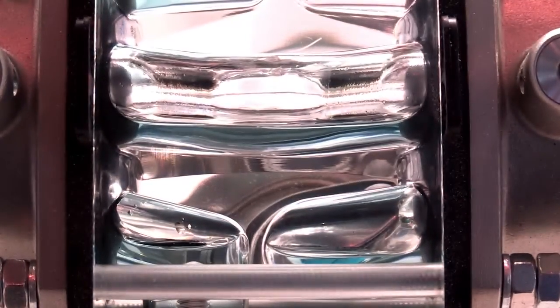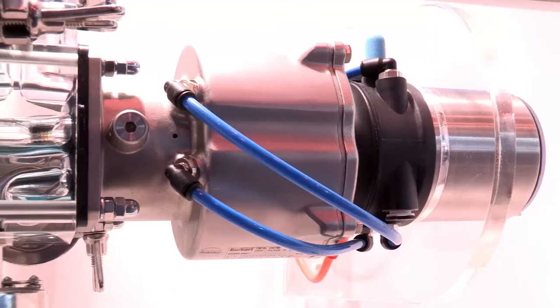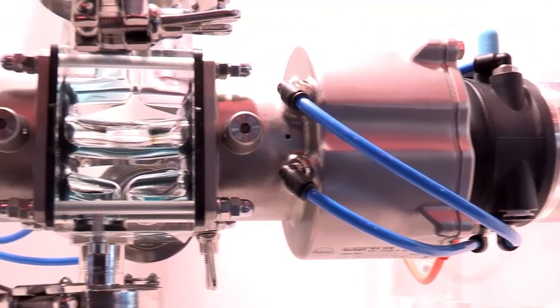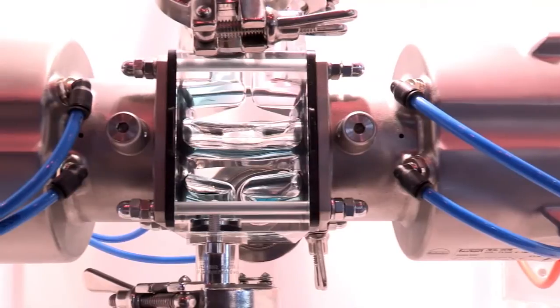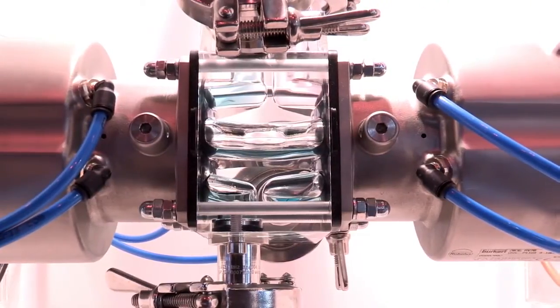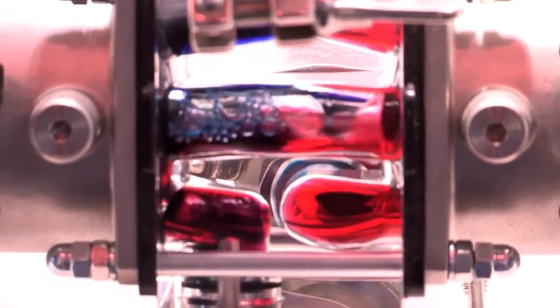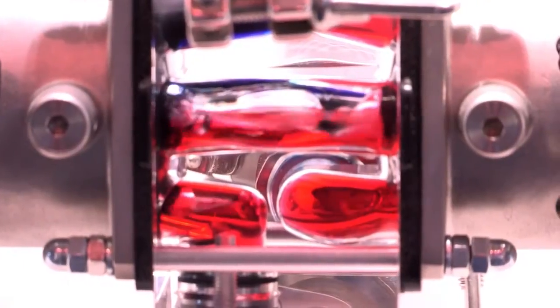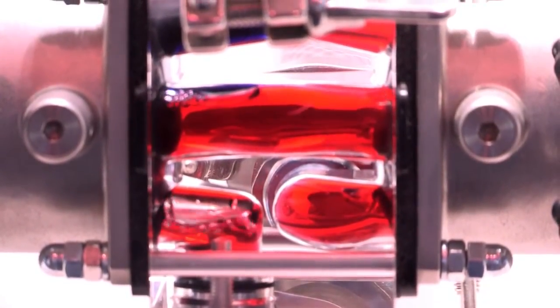Burkert has been in the field of pharmaceutical and food and beverage for years and we have been very successful on the automation part. We have now introduced elements on top of the stainless steel actuation. We have a new actuator and we still have the same advantages we had with that double seat diaphragm.